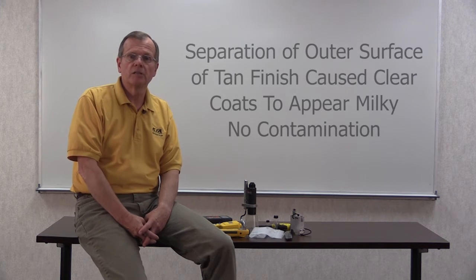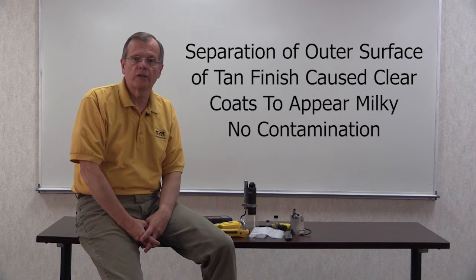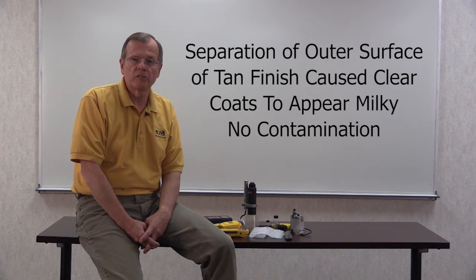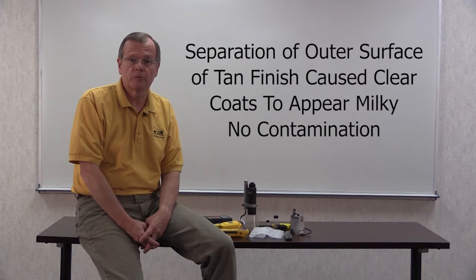In this case, the microscopic analysis confirmed that the problem was occurring in the outer surface of the tan coat. This separation caused the clear coat to have a milky appearance. Contamination between coats was not visible.